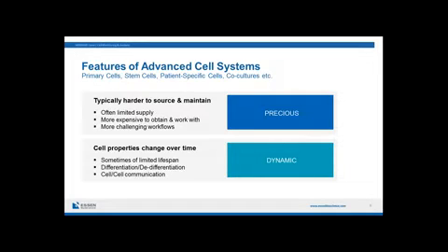The exemplification of this would be, for any of you working with CHO cells or HEK cells or HeLa cells, you probably get to the end of your working week and you throw away unused cells, you discard them, they're low cost, and you don't worry too much about that. I suspect for those of you working with human stem cell derived neurons, for example, you're not throwing away cells as a matter of course because they're expensive and they're precious to you, and you're trying to extract the most information that you can from them.